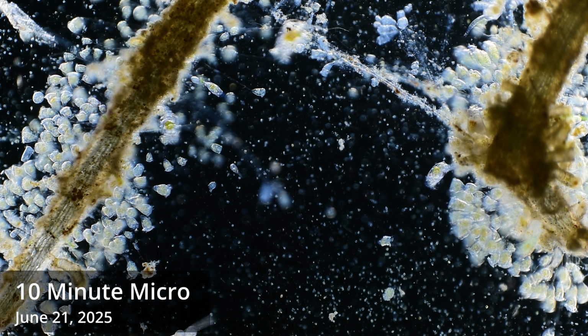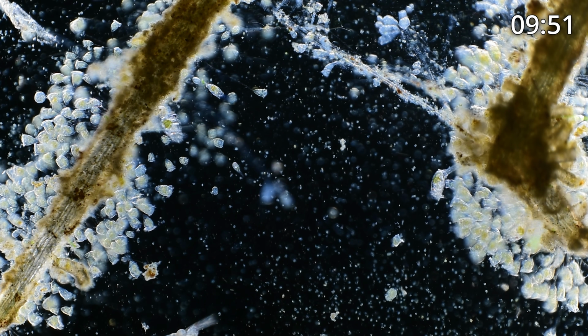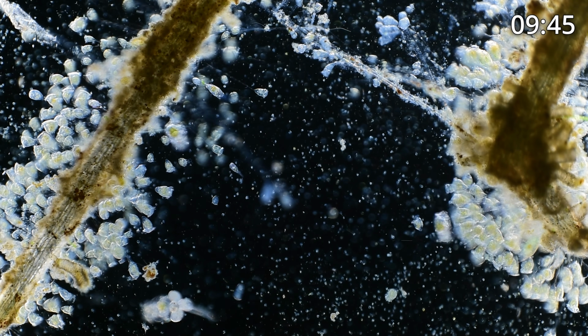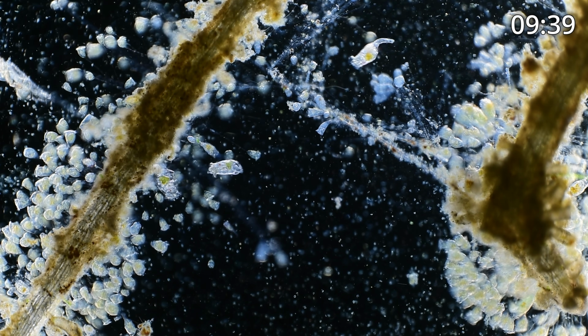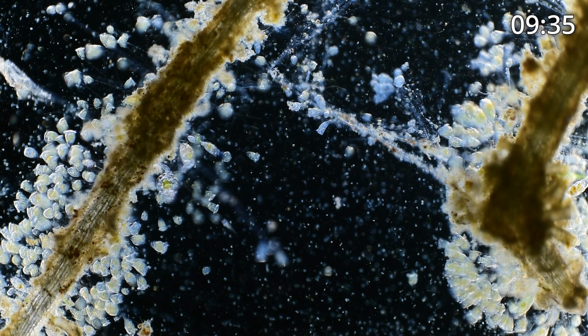Hi everyone, it's time for a 10-minute micro where I'm going to spend 10 minutes looking for the first time at a slide, and I'm going to watch it with you. Let's start by taking a look at this root from a floating plant at a nearby fishing pond. And as you can see, it's absolutely covered with peritrichs and rotifers.